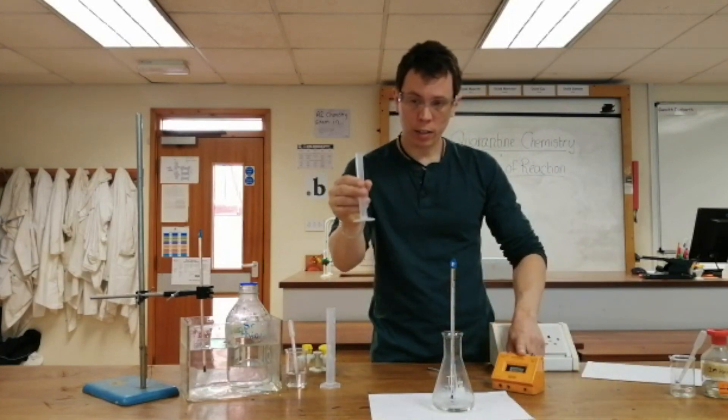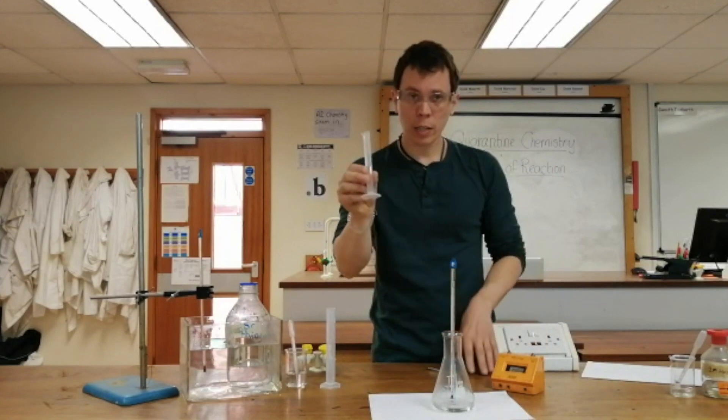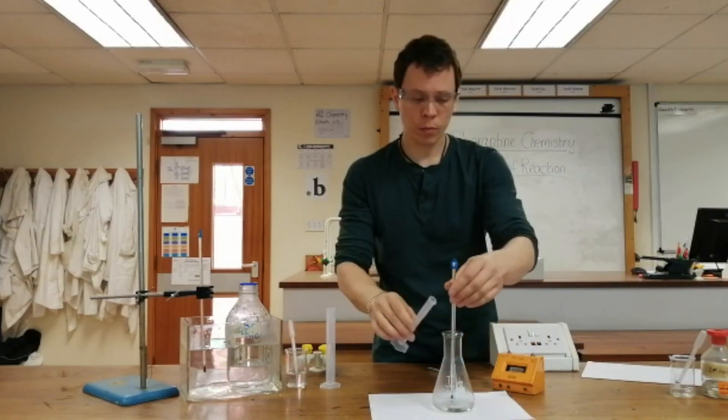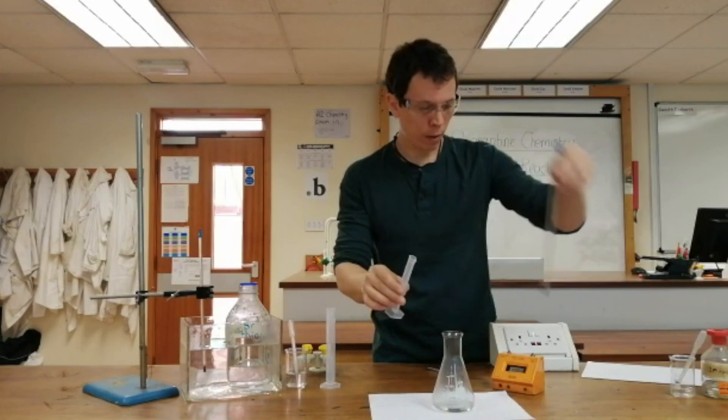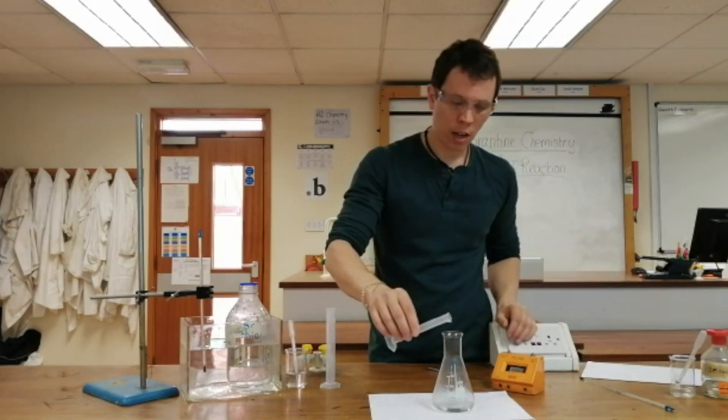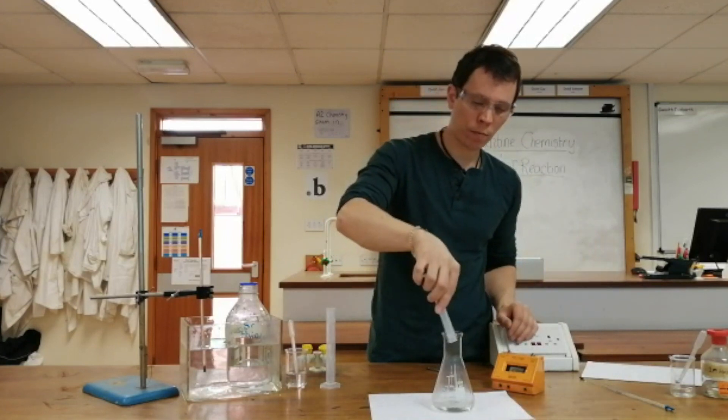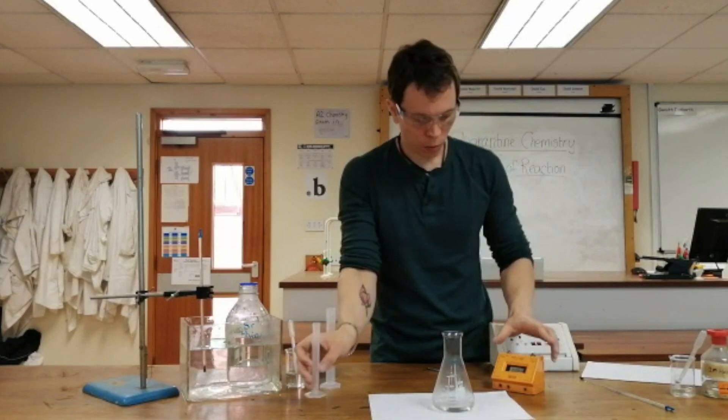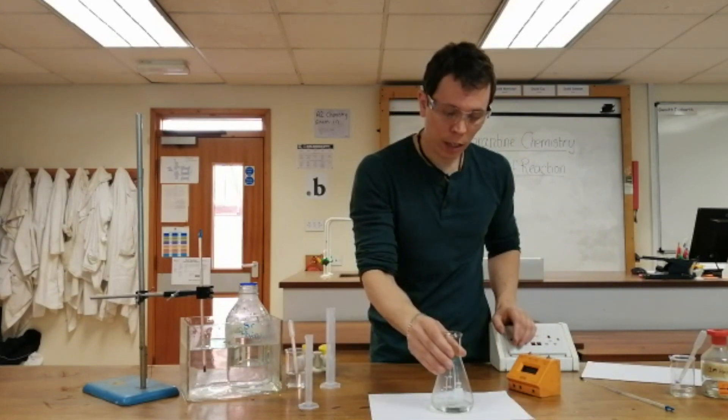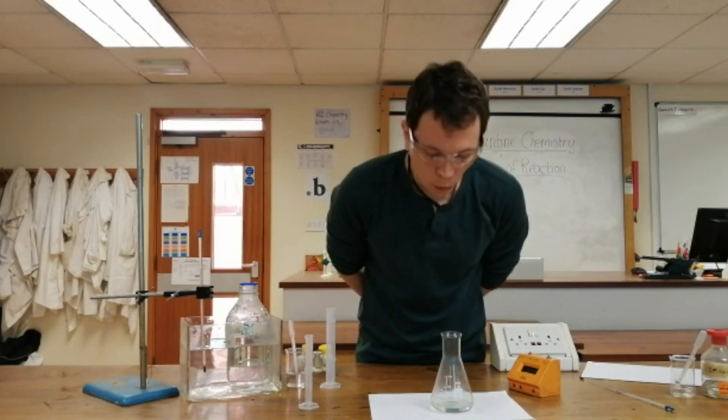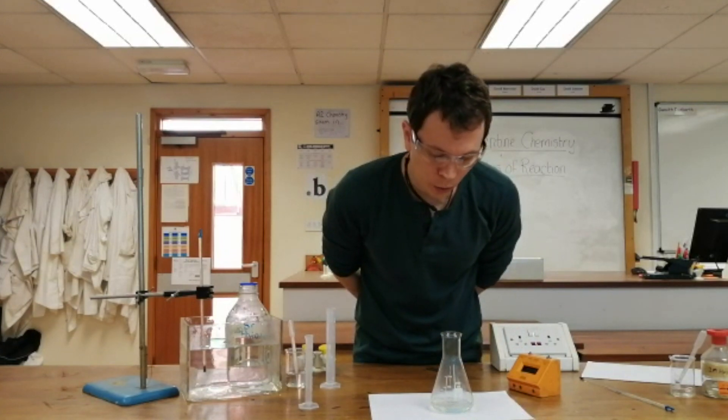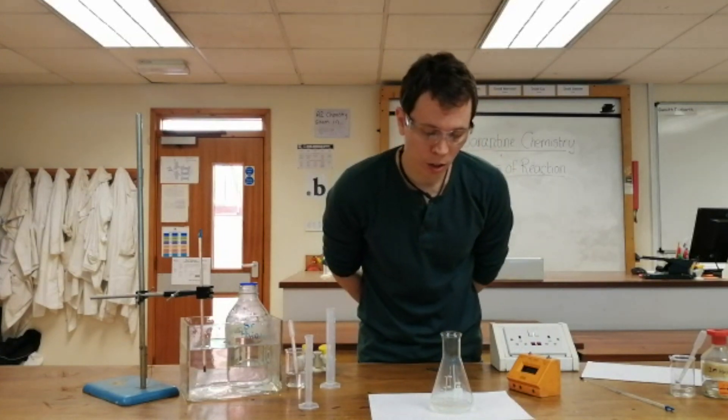I've got my 5 centimeters cubed of hydrochloric acid. I don't need my thermometer in there anymore. I'll pop my 5 centimeters cubed in, start my stopcock, give it a little swirl so it's all mixed around together, and watch until I cannot see through the mixture and I can't see the cross anymore.